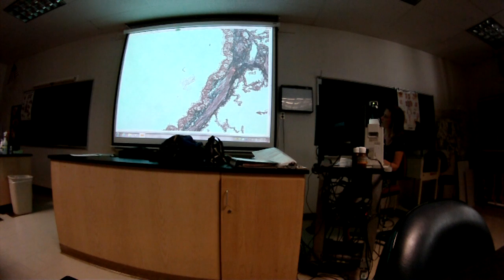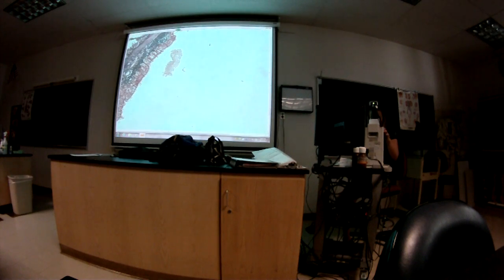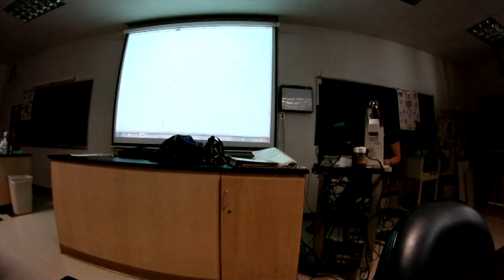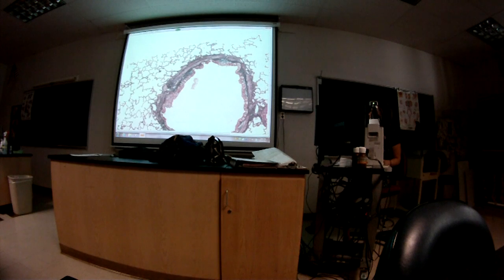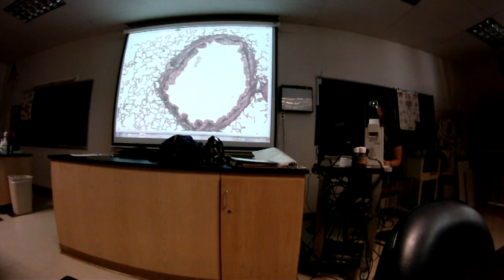Good. There's another example right there. Okay, and then go back out, and what is it? What is this organ is the question, the circular one here. Okay, this right here. What is that organ? It's question 9.